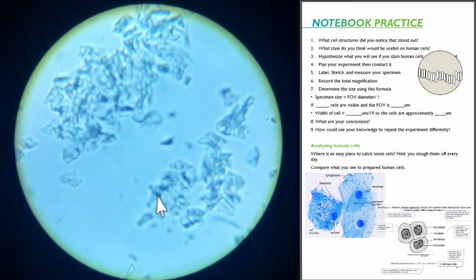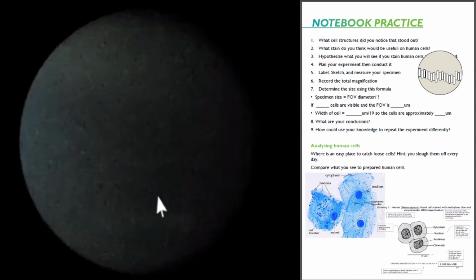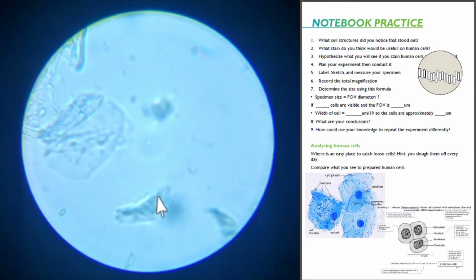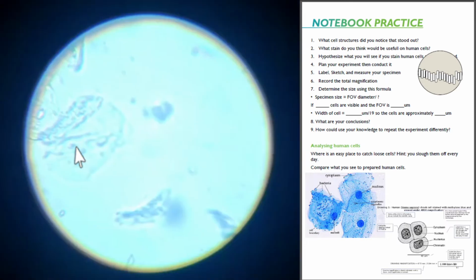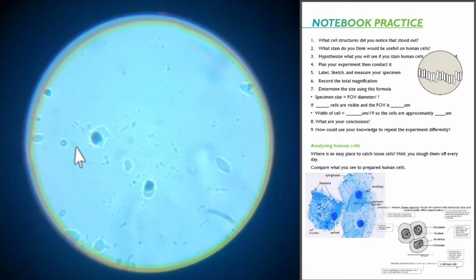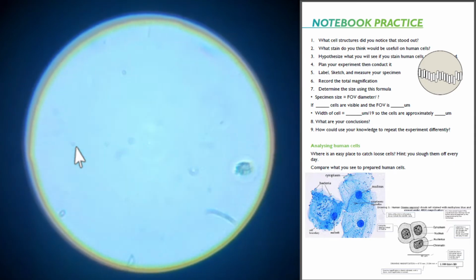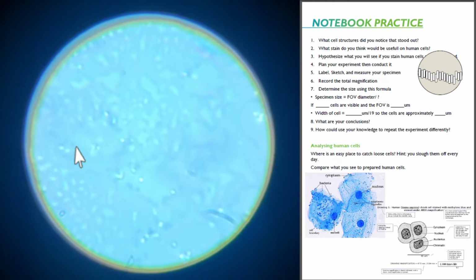Alright, I'm going to be brave. I'm going to flip the revolving nose piece one more time. Oh yeah. Look at that. You see the cell. I'm going to look around and see if I can find some others. Air bubble. Oh, is that a decent cell?